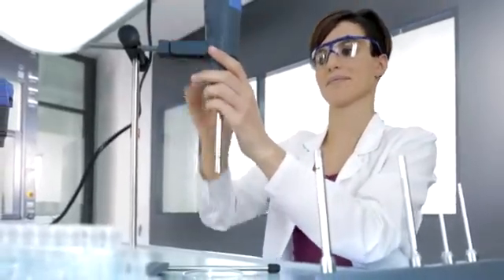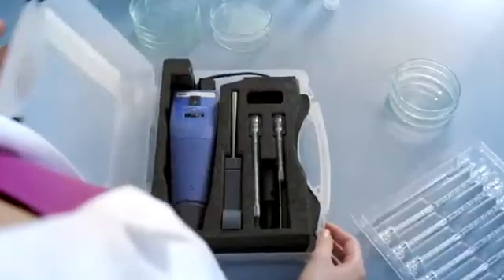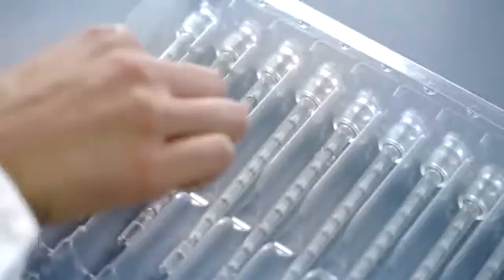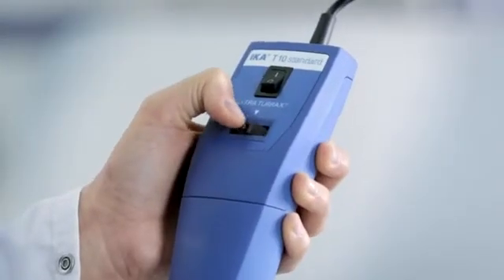The T10 standard PCR kit, providing a choice of disposable dispersing tools. Fast and easy tool change out, handheld or stand mounted operation. Designed for contamination-free PCR analysis.